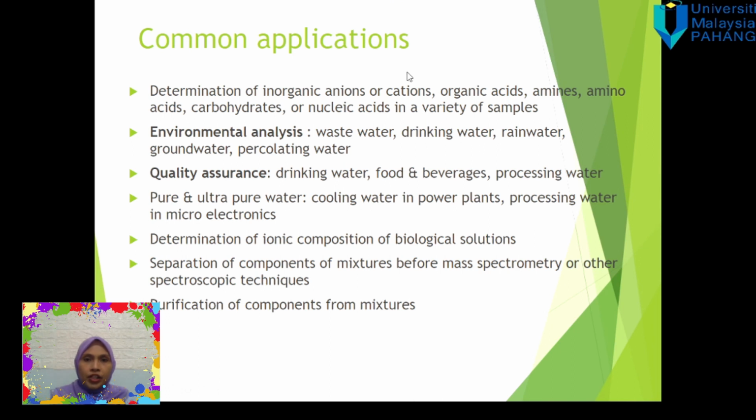And for the common application of IC, normally we determine inorganic anions and cations. For environmental analysis in water, we want to know the positive and negative charge ions. For quality assurance, for water and pure water, determination of ionic composition, separation of compounds, and purification of components from the mixture. That's all for IC. Thank you.